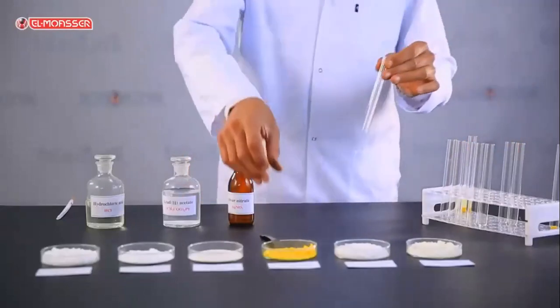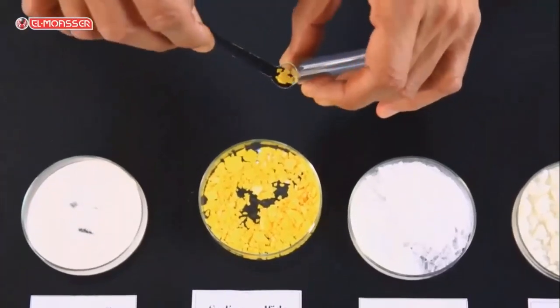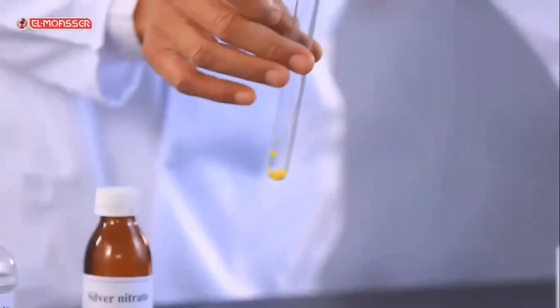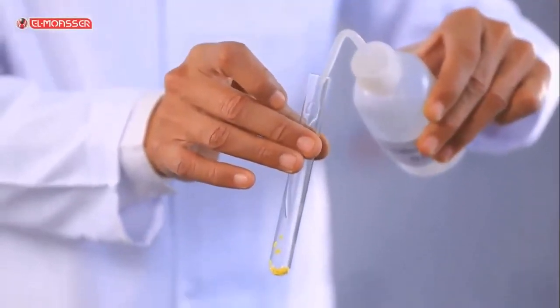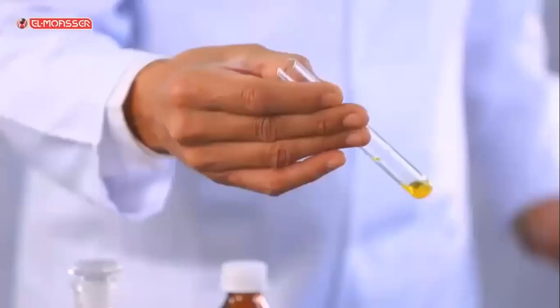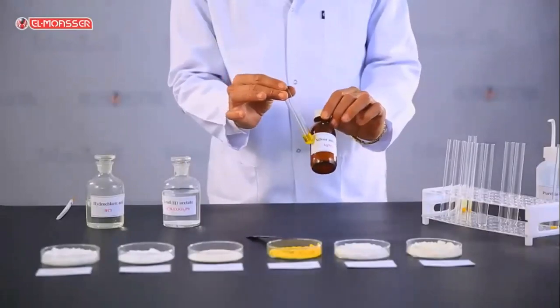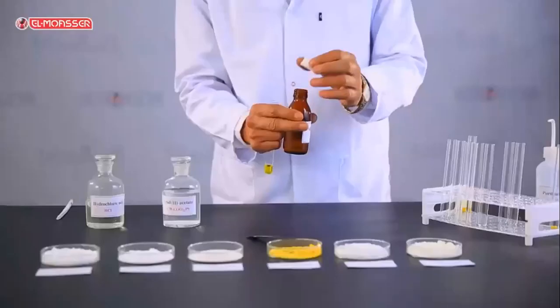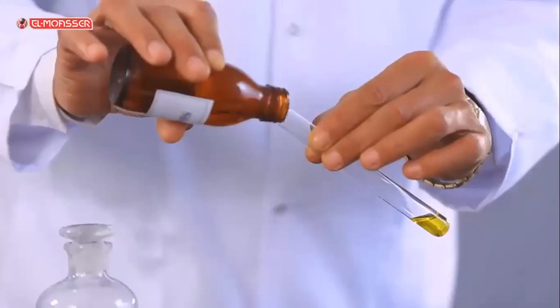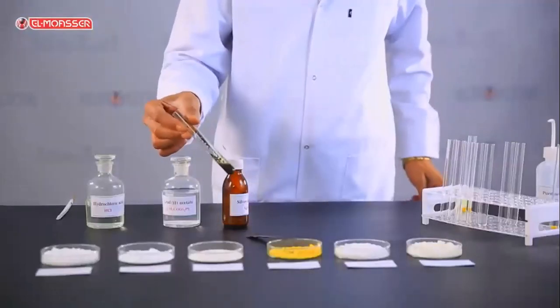Confirmatory experiment. Add a small amount of sodium sulfide salt to a clean test tube. Then add distilled water with shaking to form a salt solution. Then add to it silver nitrate solution. What do you observe? A black precipitate of silver sulfide is formed.